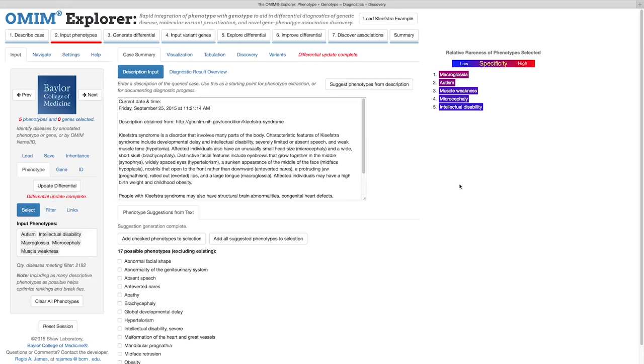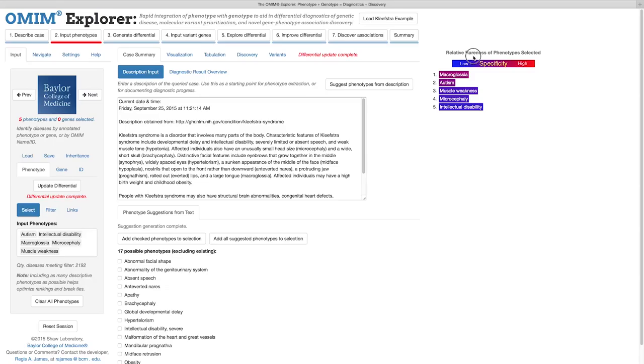In this list, input phenotypes are arranged and colored in order of decreasing rareness among diseases in the OMIM catalog. Red phenotypes are the most rare, and the blue ones are the most common. In this context, rare means exhibited in a relatively small quantity of OMIM diseases, and common means exhibited in a relatively large quantity of OMIM diseases.